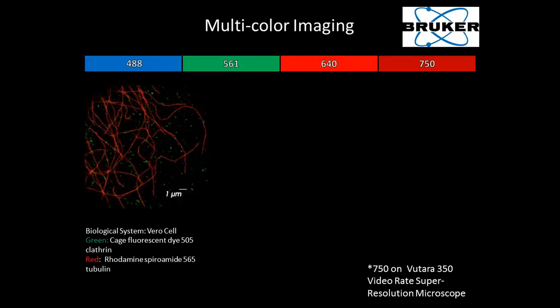That's why we have really high-powered lasers, about 1-watt lasers, to be able to do the photo switching. Initially when this field started, people had a really hard time photo switching, let's say Atto 488 or Alexa 488, but Alexa 647 is really easy to photo switch. So keep that in mind when you're trying to figure out what dye to use for what structure.